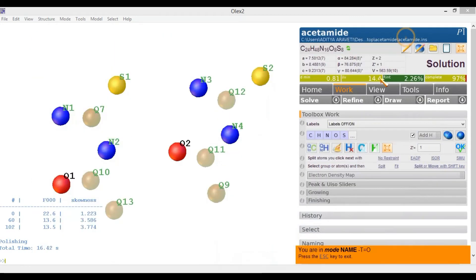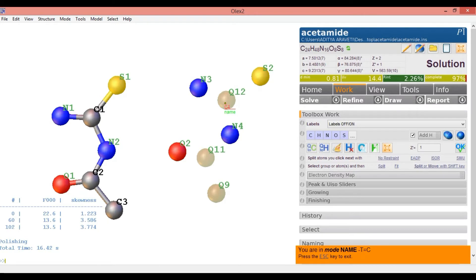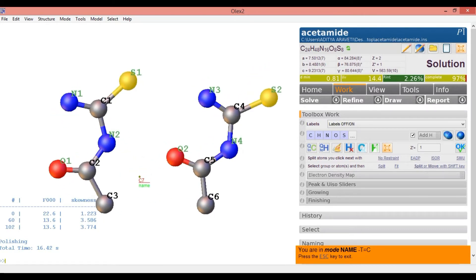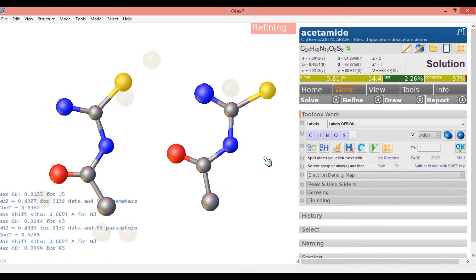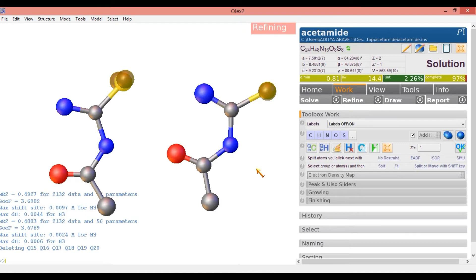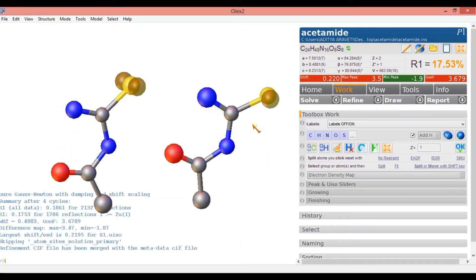Let us give the naming. I am selecting carbon here and clicking on each atom: C1, C2, C3, C4, C5, C6. Now we have got some outline of our expected structure. Now we need to refine. Here I am refining this — just refine normally. After refining normally, we get a picture like this.